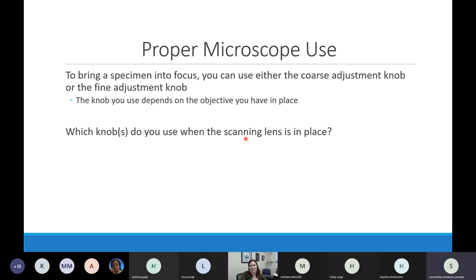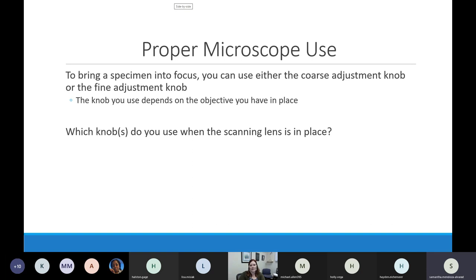When I have the scanning objective in place - the red lens - I can use both the coarse adjustment knob and the fine adjustment knob. The scanning objective is tiny and there's lots of space for the stage to move without bumping into it. So when the red scanning objective is in place, you can use the coarse adjustment knob that moves the stage a bunch, or the fine adjustment knob that barely moves the stage.